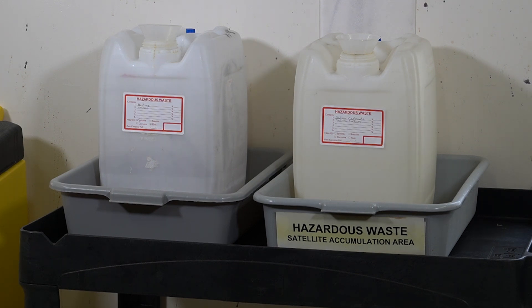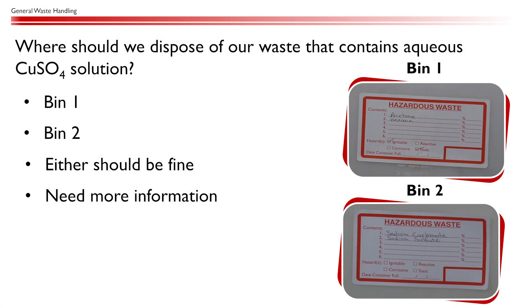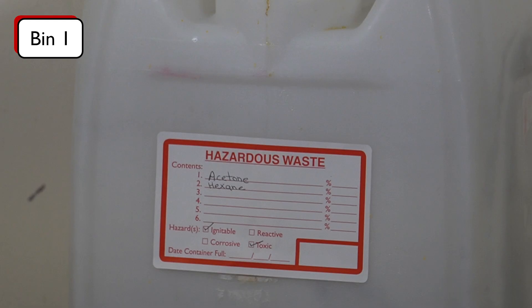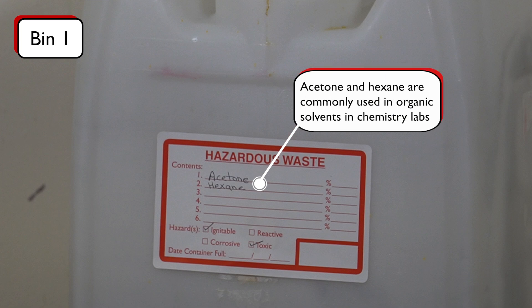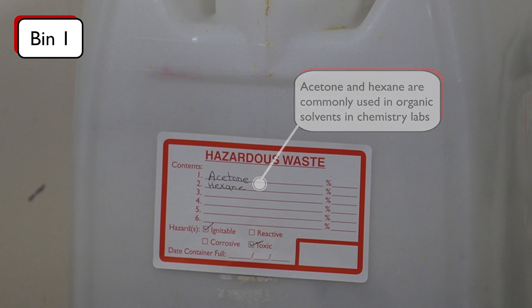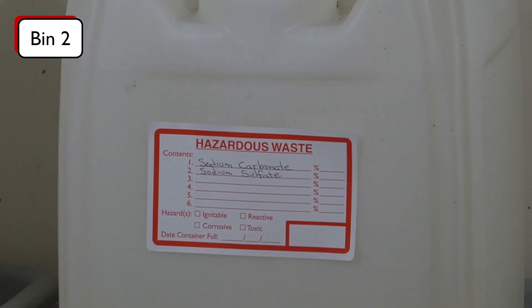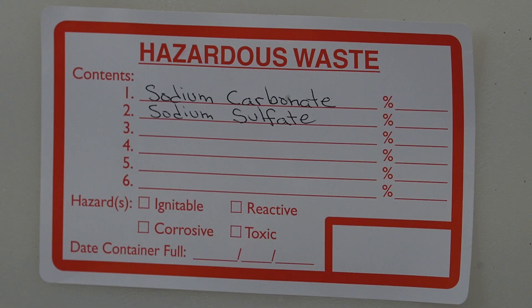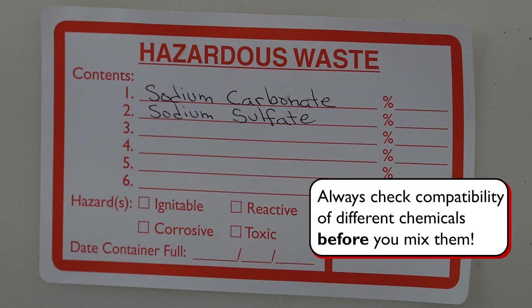This is especially important when an experiment involves multiple waste streams. Where should we dispose of our waste that contains aqueous copper sulfate solution? The label on bin 1 suggests it's for organic wastes, including acetone and hexane, so we definitely should not put our aqueous copper sulfate waste in bin 1. The label on bin 2 says that it is for aqueous waste that contains sodium carbonate and sodium sulfate. If you are new to the field of chemistry and are not sure whether copper(II) sulfate is compatible with sodium carbonate and sodium sulfate, you should ask your instructor for clarification.